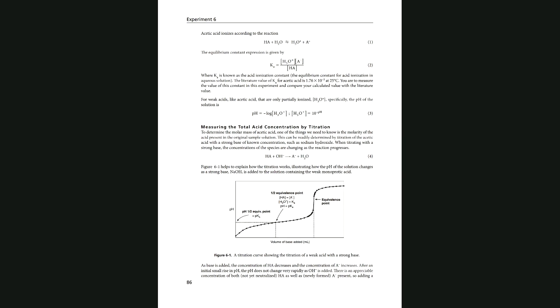And then if you take the anti-log of pKa, you get the Ka value for your acid. So that's what we are trying to do today. The definition for pH will be covered in lecture.